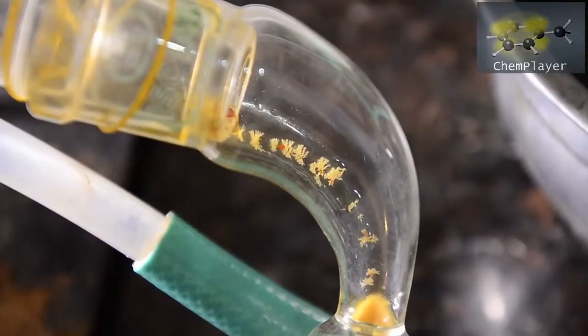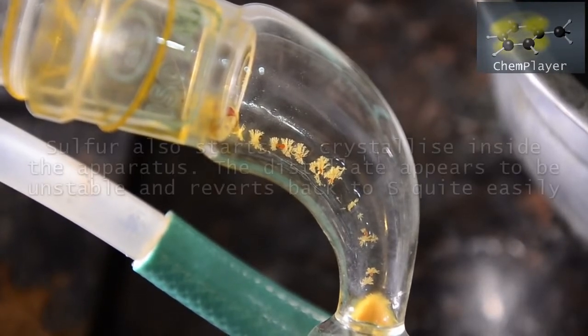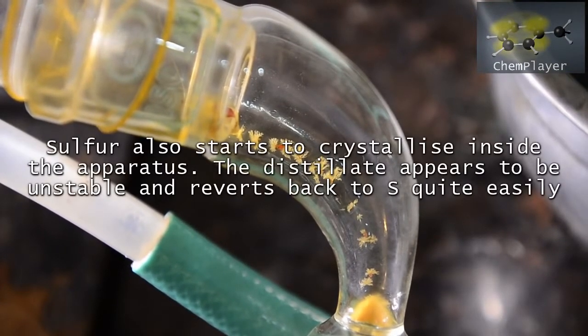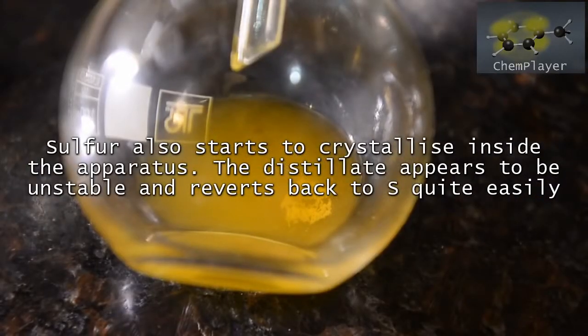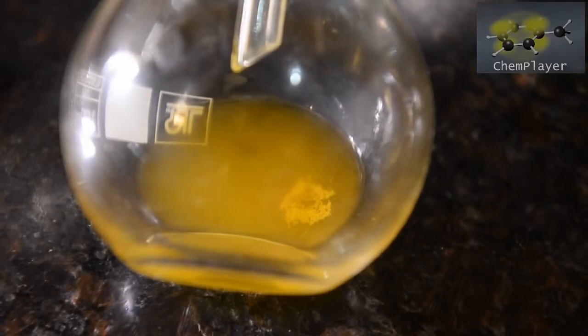We also notice an interesting phenomenon in the receiving adapter and in the receiving flask. Crystals of what appear to be sulfur are forming. This suggests that our intermediate sulfur-bromine compound is decomposing and distilling over.